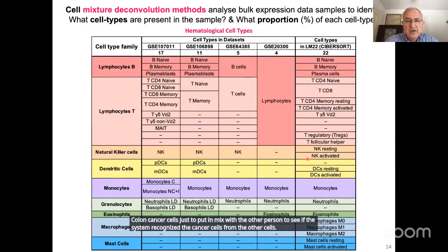So in the analysis of this, what is the first challenge? The first challenge is how many cell types and subtypes do you want to distinguish? These are the different data sets, as you can see, and this is our reference CIBERSORT with the LM22, sorry. Maybe you say, I'm very much interested only in T cells. Okay, T cells, and how many types of T cells?